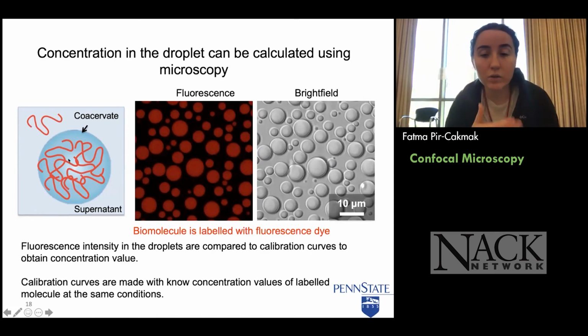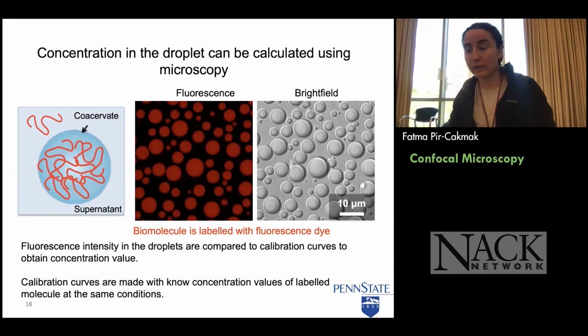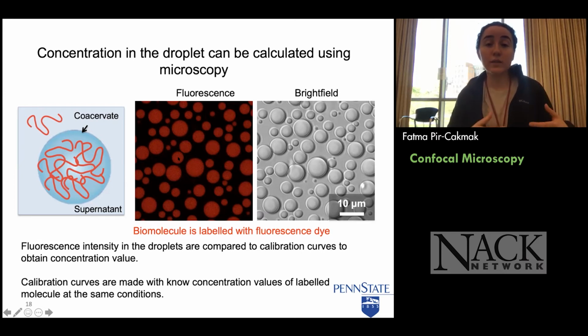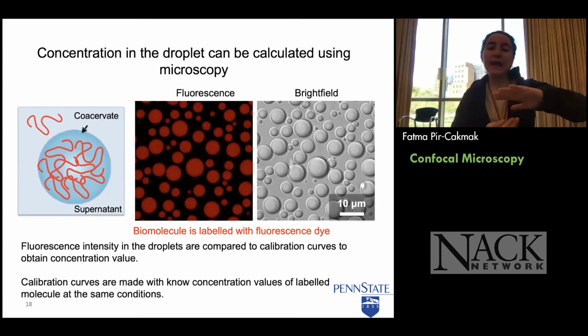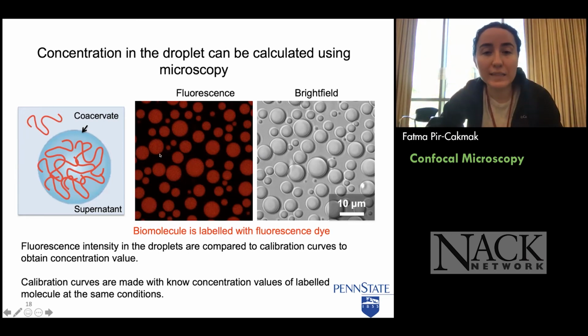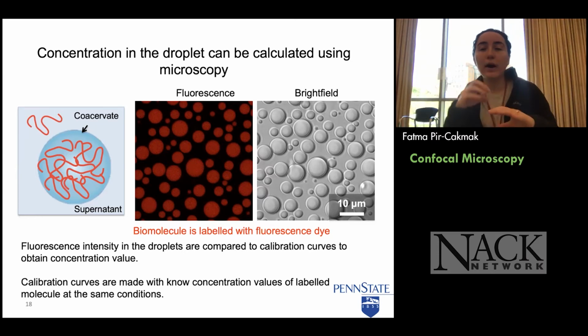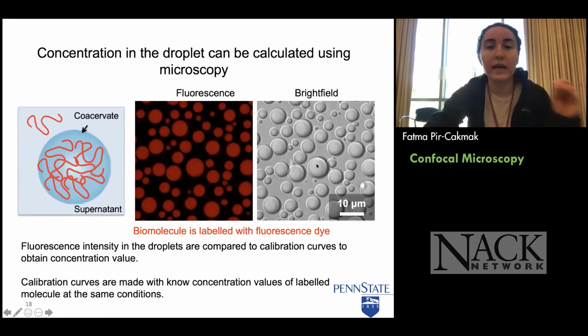If you have a coacervate droplet, you have a bright field image here, meaning nothing in fluorescence, you're just looking through light. And here you're looking at the fluorescence signal, which means I'm using, I think it was 647 nm excitation wavelength, and then I'm looking at the emission coming out of my droplets, and this is how they look. You can see that the labeled RNA I used is partitioned into the droplet. It's a perfect match with the droplets you see in the bright field and the fluorescence.